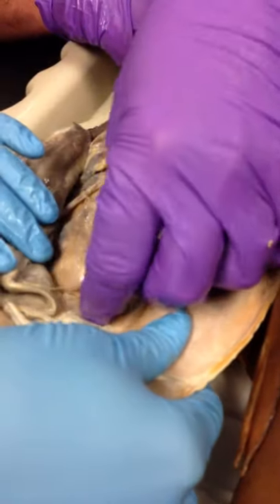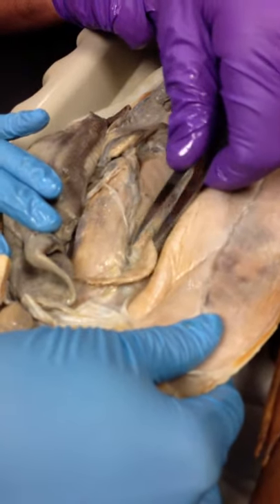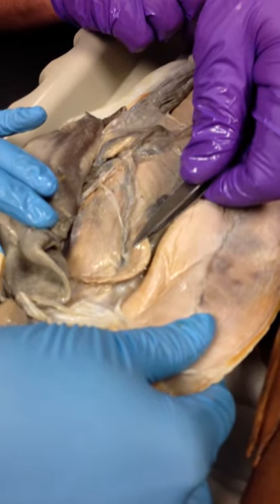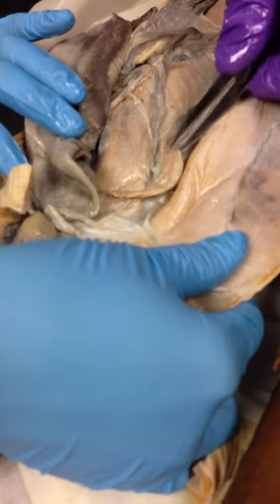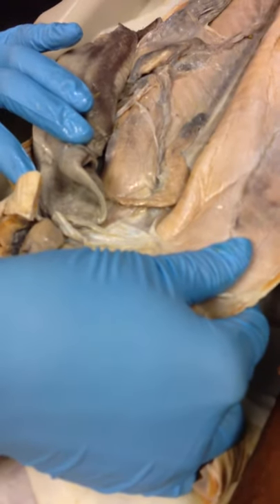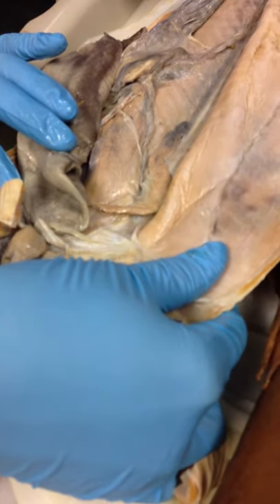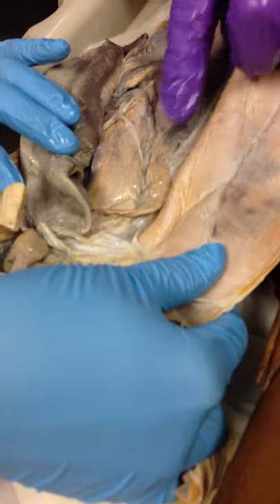Okay, so we're looking at the structure right here. That's an ovary. It's flat right here because it's not developed, right? That's an ovary. No eggs, no developed eggs inside it. It would be obvious if we saw some. They're about the size of marbles. Pretty cool place for the ovary, right? I mean, it's safe. In evolution, if you lose your ability to reproduce, you might as well be dead. If this loses its ability to reproduce with the reproductive organs here, it probably is dead.